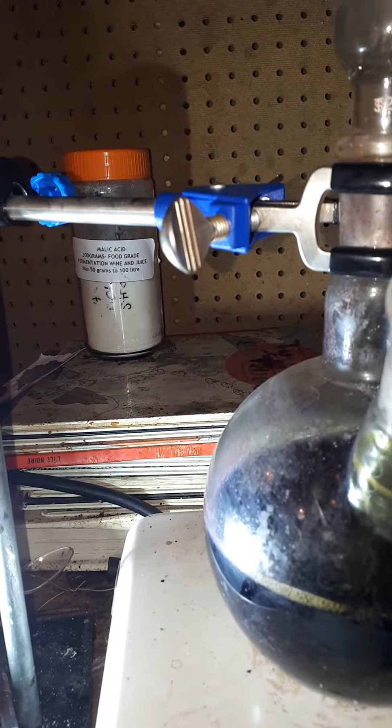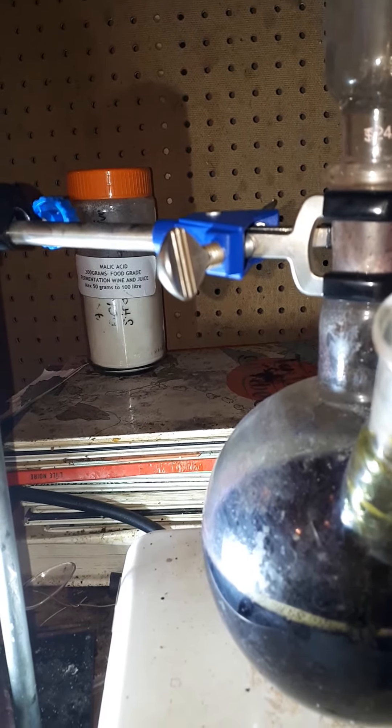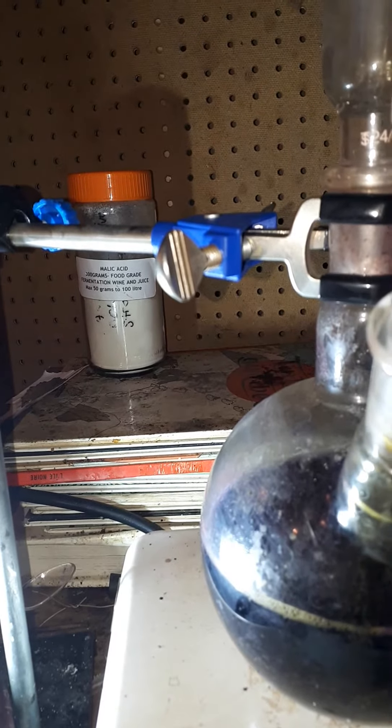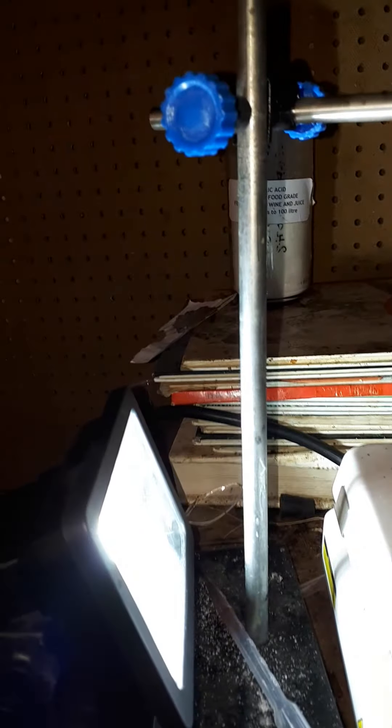Dripping very slowly to get it to react. It's at 40 degrees Celsius — a nice, steady flow.